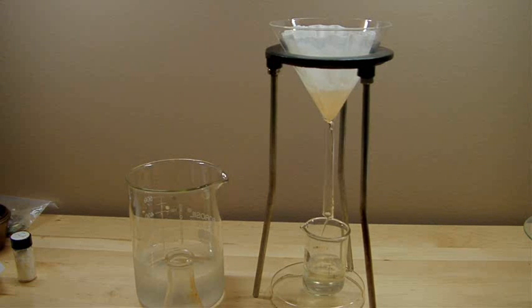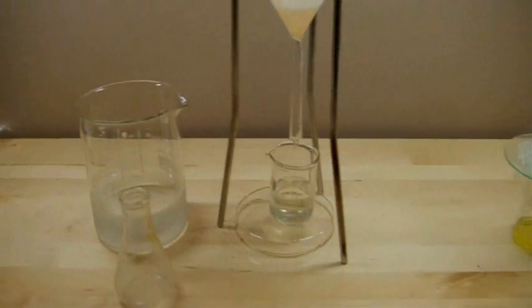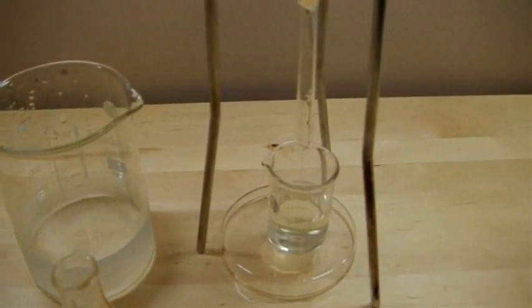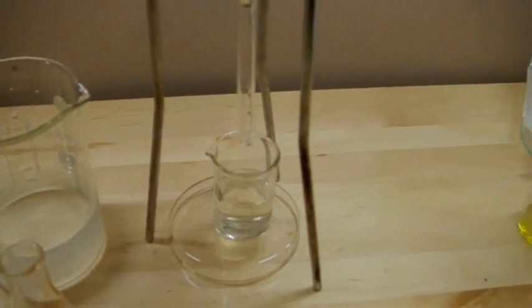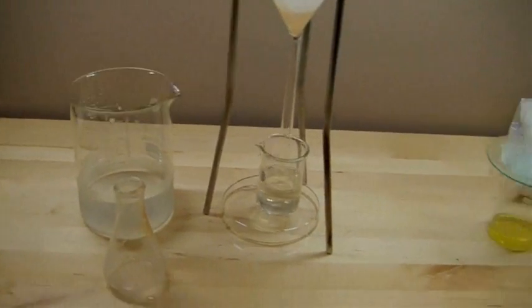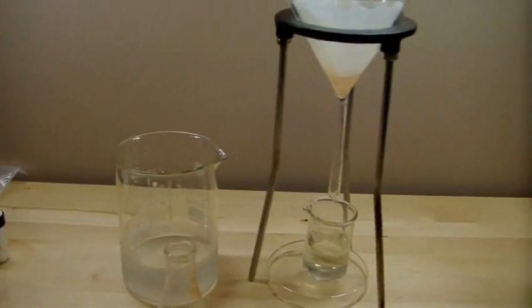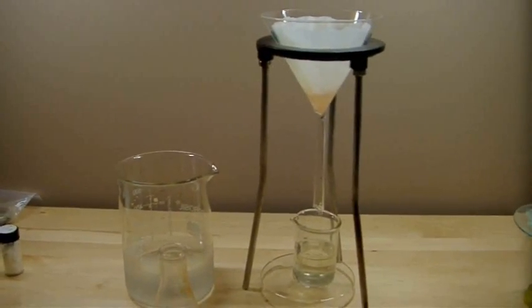And you can see as I thought, that's removed most of the color from the solution. So now we should have a fairly pure solution of potassium iodide with the potassium iodate precipitate trapped in the filter paper.